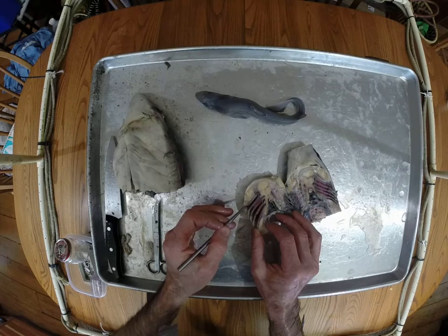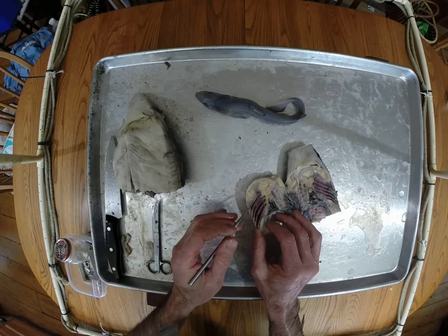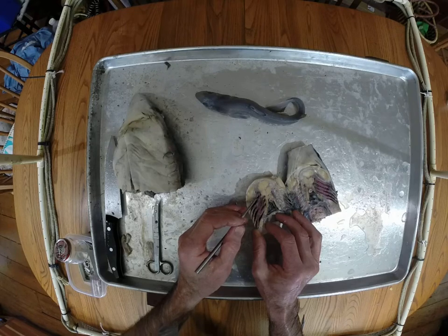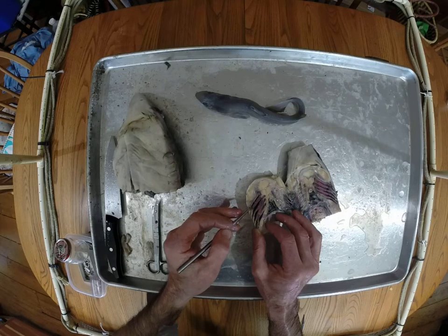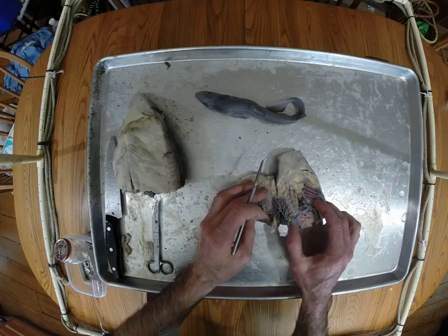Okay, and so we can see we have one set, 2, 3, 4, 5. Okay, so we have really 4 arches that have complete holobranchs. That is, there's a hemibranch on this side and a hemibranch on that side. And you can see here's that interbranchial septum, which grows out from the arch all the way to the exterior of the fish. And let's actually, I'm going to move over to this part of the section here because this shows it a little better.